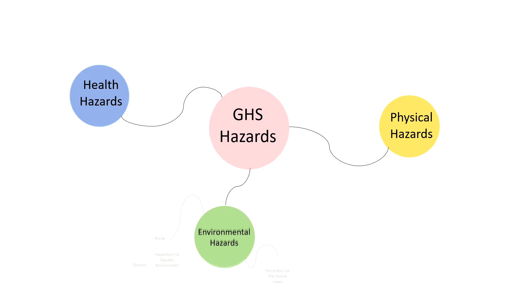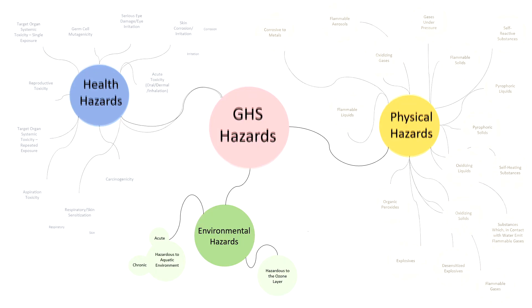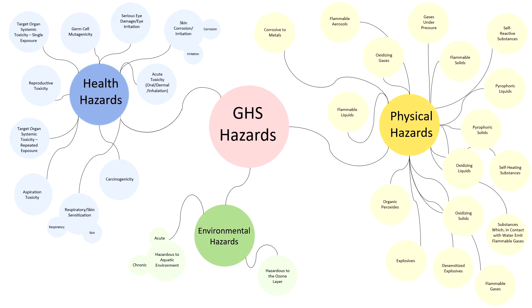Each group is subdivided into classes. There are two environmental hazard classes, one of which, hazardous to aquatic environment, has subclasses based on exposure duration. There are 10 health hazard classes and 17 physical hazard classes. There is one chemical hazard, corrosive, that is both a health hazard and a physical hazard.